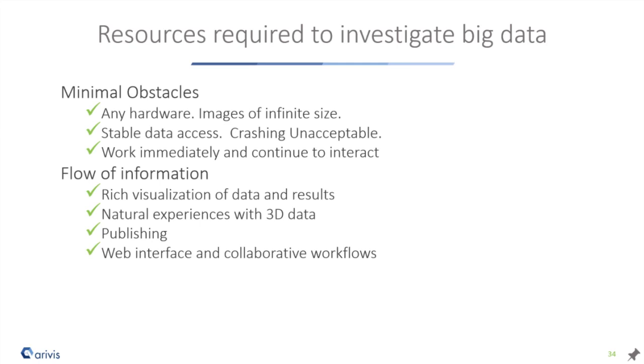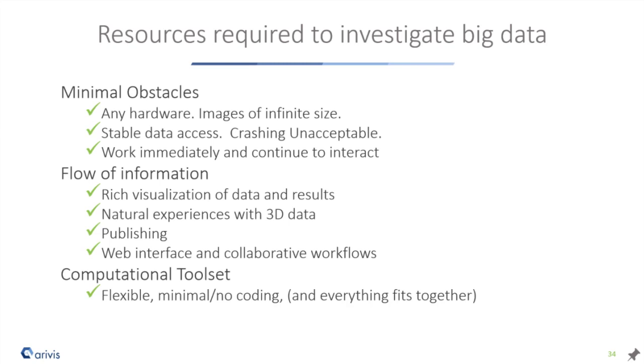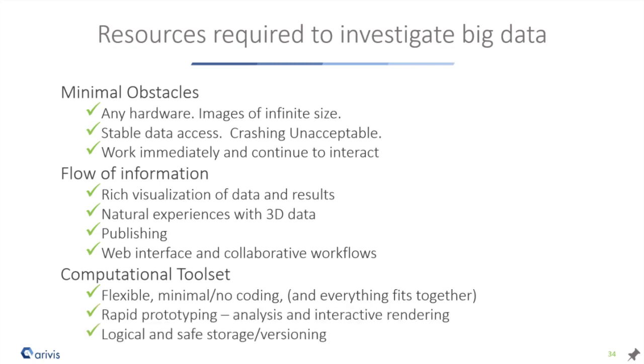Also, we spend quite a bit of time, and we're very interested in building web interfaces and collaborative workflows. So we also have tools, which we didn't look at today. I'll tell you a little bit about it, but we have tools for enabling you to interact with these SIS files completely via the web and in a completely collaborative way. And I think we all agree that that's really important in this day and age, and it's going to become ever more important. And then finally, we have this very flexible computational tool set, and we really just started to scratch the surface of that today.